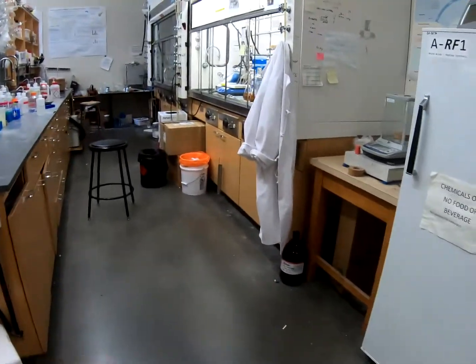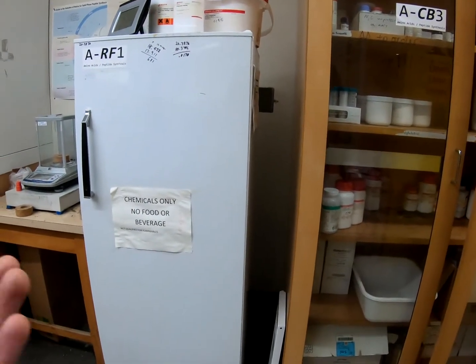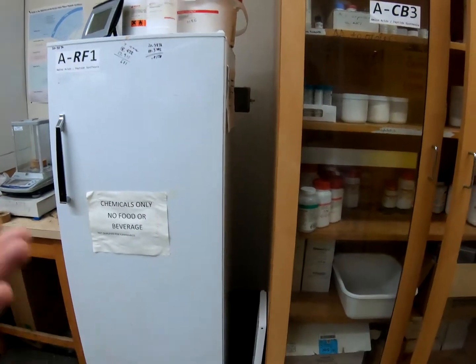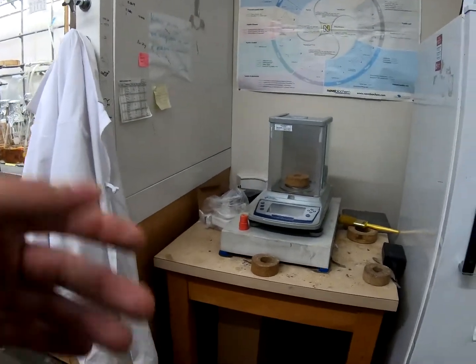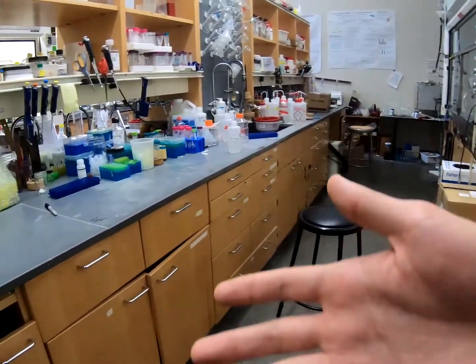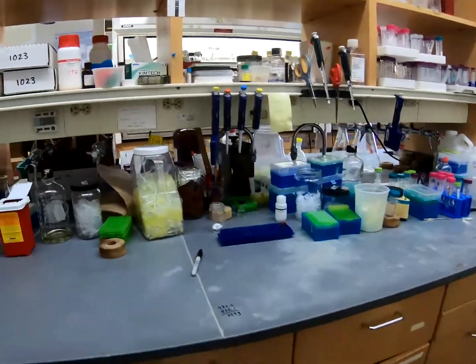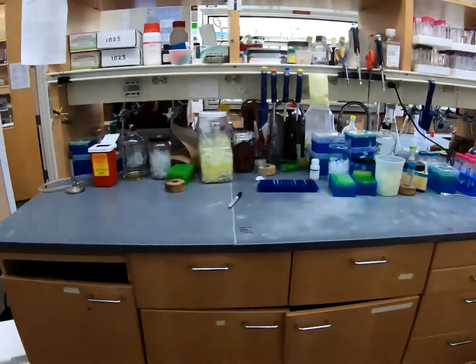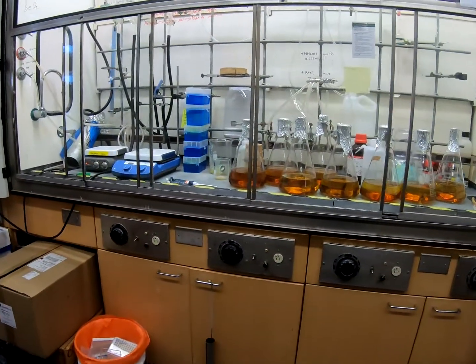Over here we've got our refrigerator and our amino acid cabinet. Both of these are filled with the amino acids that we're typically using in our synthesis to make our peptides, and then a weigh station to actually weigh them out in. And over here we've got some of the desks that we use. So we've got our bench space, cabinets underneath, storage up top, and then the full hood, usually one per grad student.